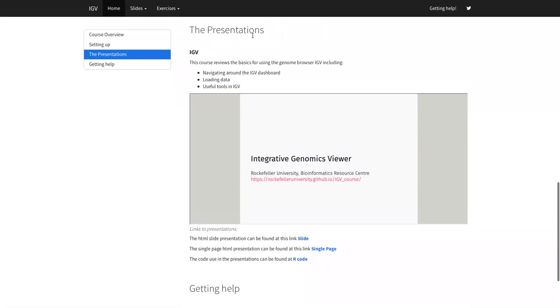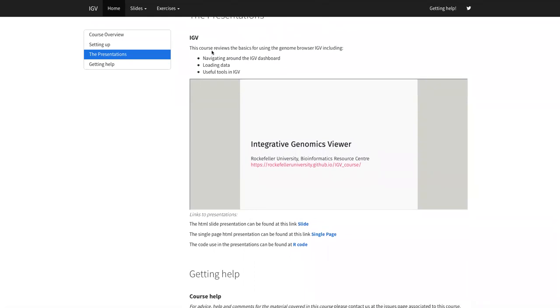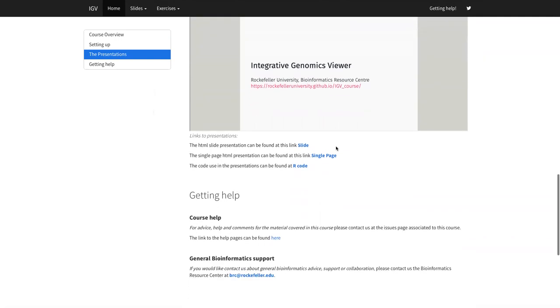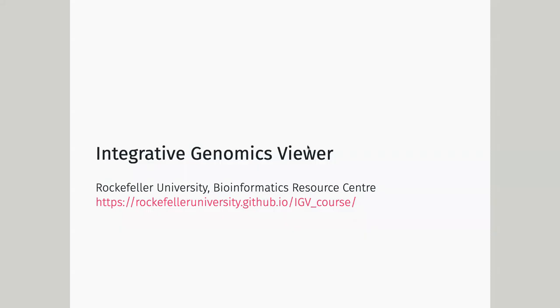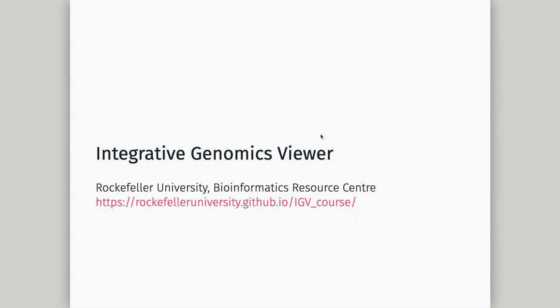We're going to learn IGV. A lot of linear genome browsers include things like IGV. Does anyone know UCSC genome browser? That's a really popular one and I'll allude to that as we go. One thing about doing this particular course is I need to move between the slides and IGV, which is a little trickier here, so forgive me as I move between the two.